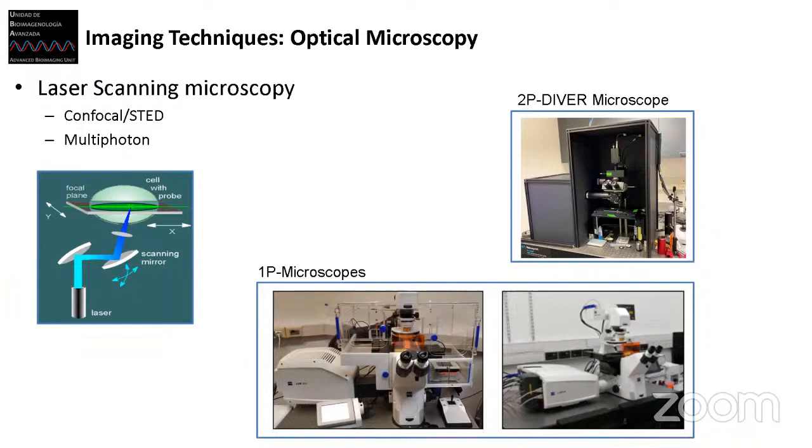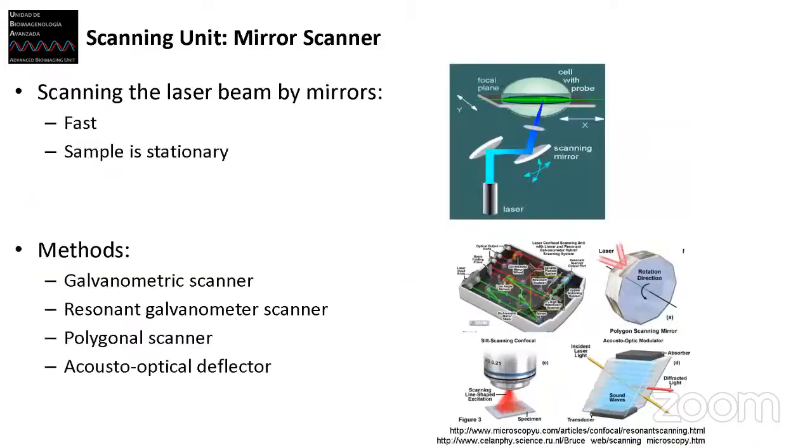And then this is the two-photon FLIM microscope that we call DIVER, because this stands for a particular detector that was developed by Enrico and Sasha here, and is particularly interesting for imaging in vivo samples without any clearing, so in native condition with high scattering, and is really, really sensitive in comparison with any other two-photon microscope.